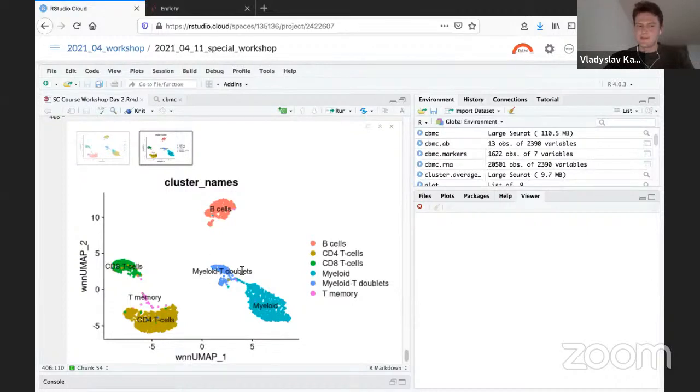So as you can see, the separation is getting better, I think, because you separate the populations much further from each other. You are getting some of the cells that are clustering now with CD8s but are of a different color, so that may be even an improvement.